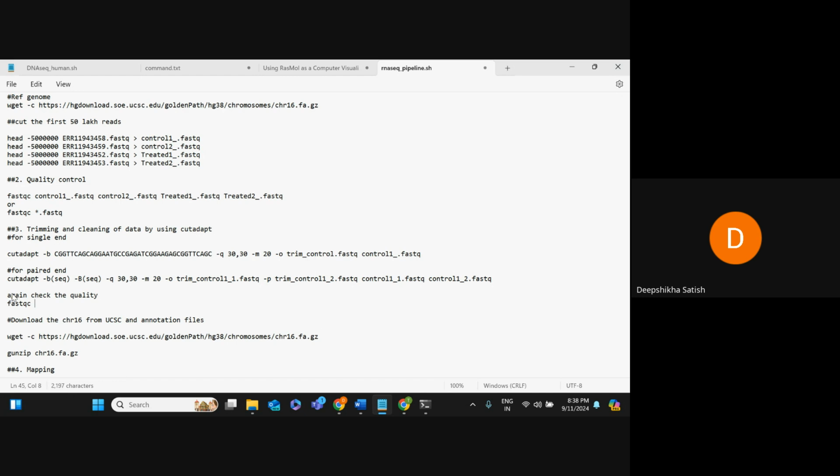For which quality am I going to check now? Ma'am, for the trim control one and trim control two. Nice. Correct. Now this becomes the output file name, right? So whatever data would be there, this will be my output, and this thing becomes the input file. After running this, you will find this particular sequence will get deleted from our data. Clear till here?